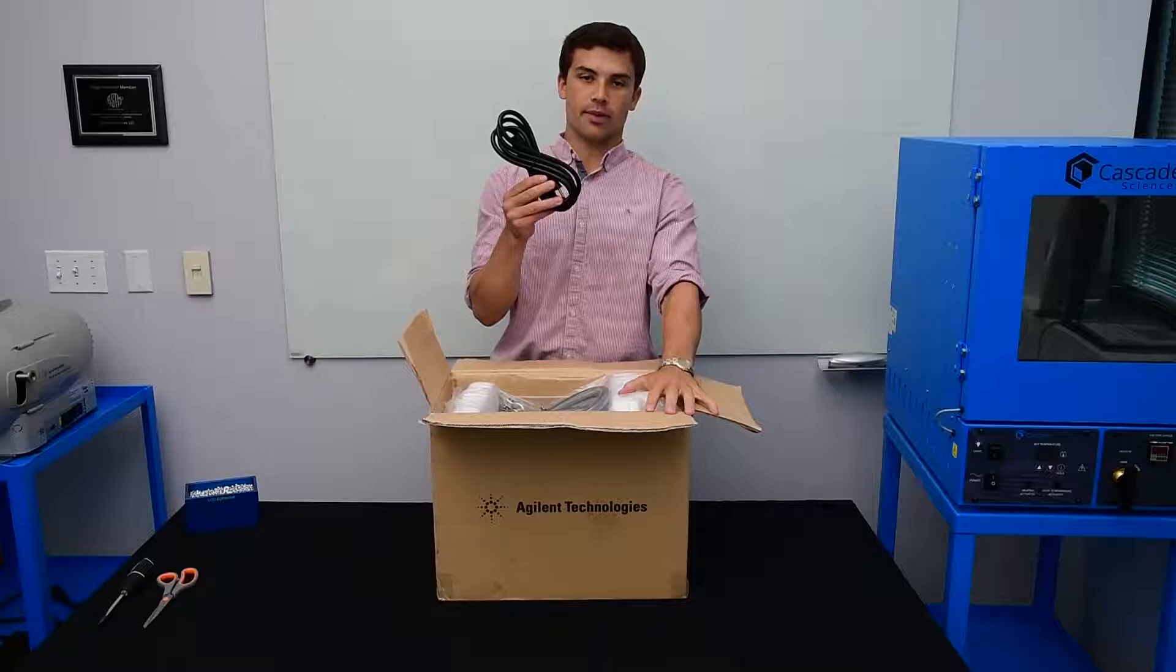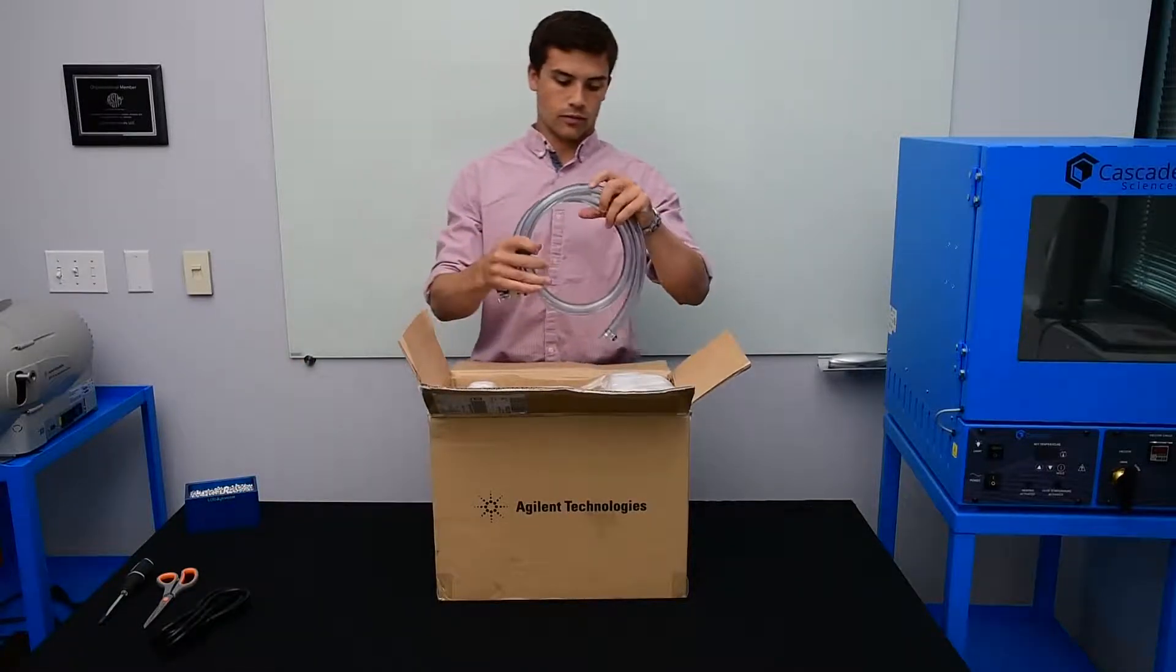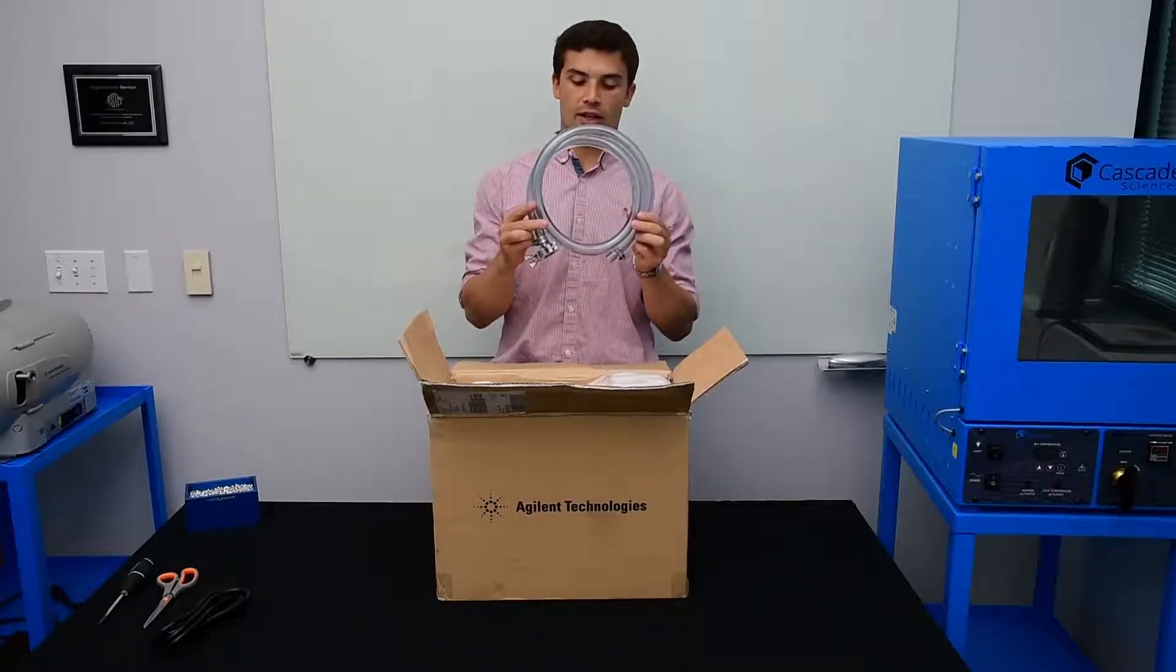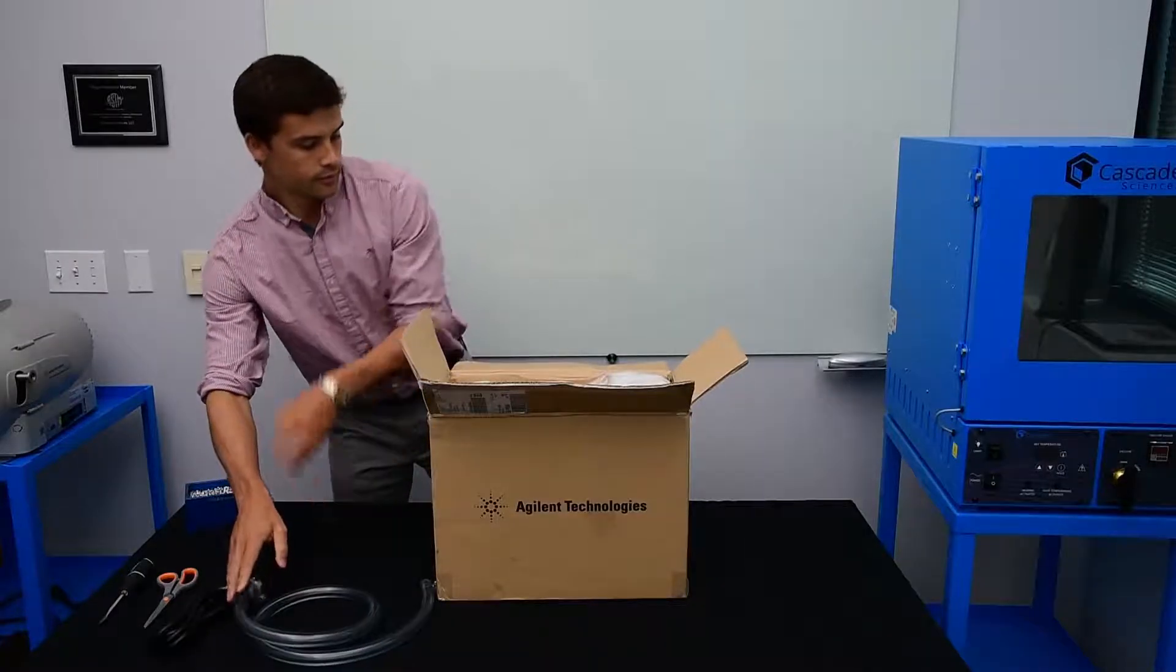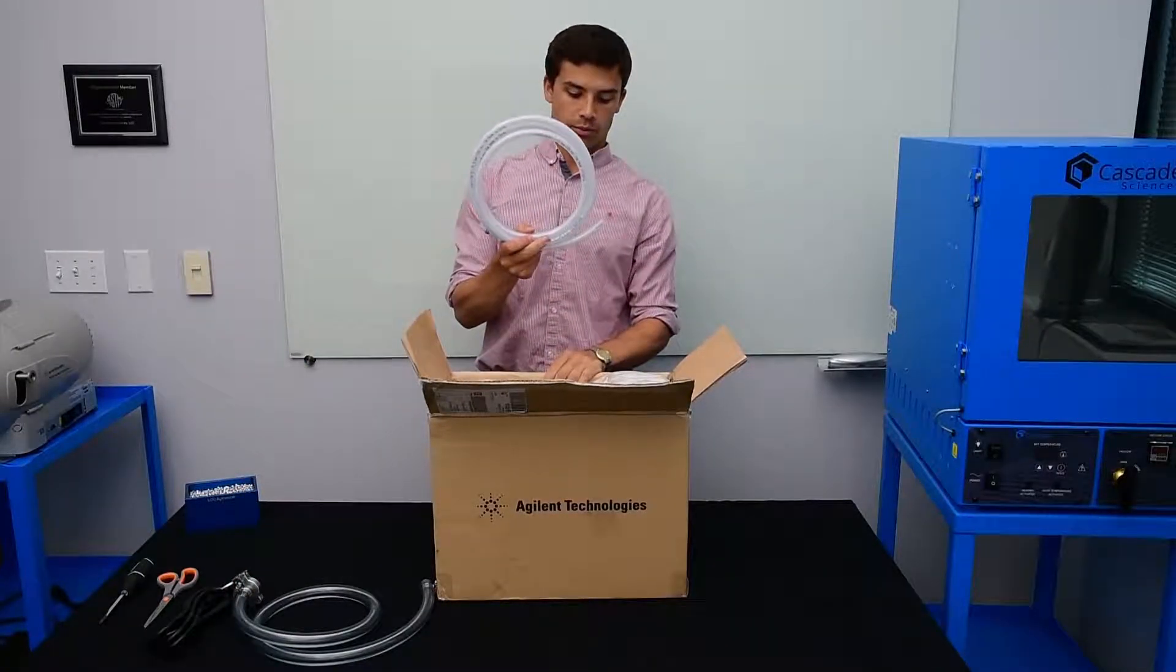First we'll pull out the power cord for the vacuum pump. Here is the vacuum hose that will go from the vacuum pump to the vacuum oven. And here is the exhaust hose for the vacuum pump.